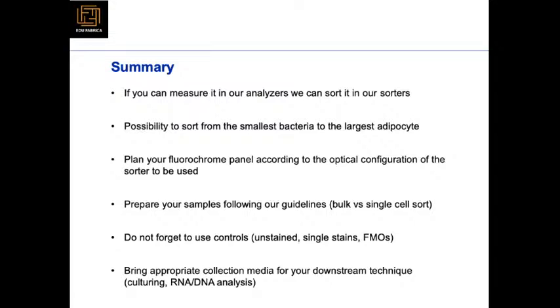So in summary, we can measure on the analyzer, we can sort on the sorters, prepare the samples as per the guidelines, do not forget the controls, and bring appropriate collection media for your downstream techniques.